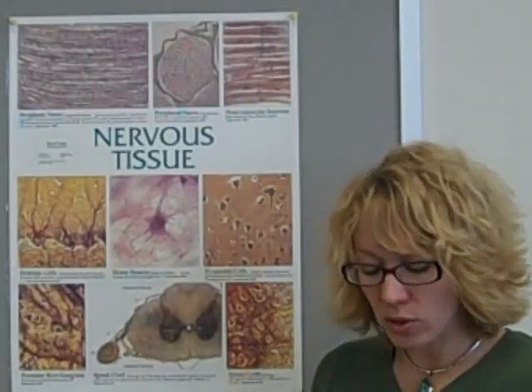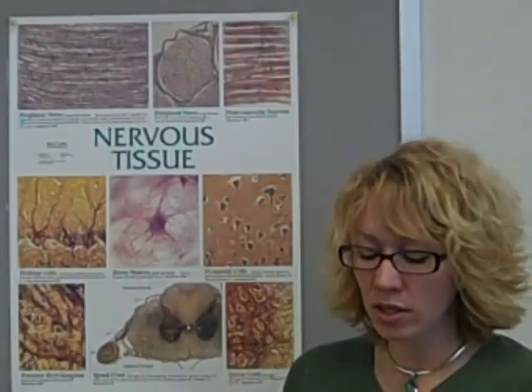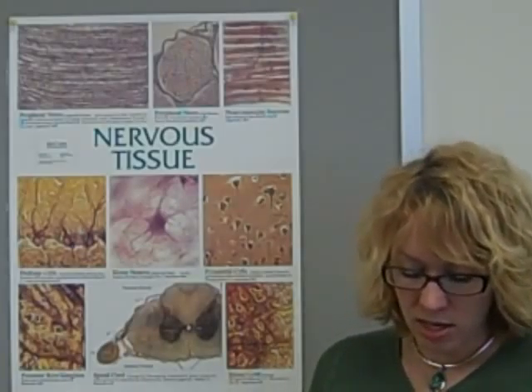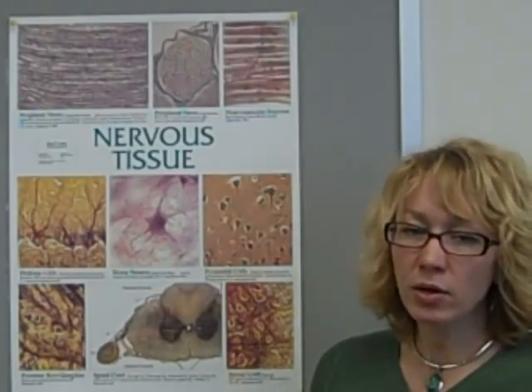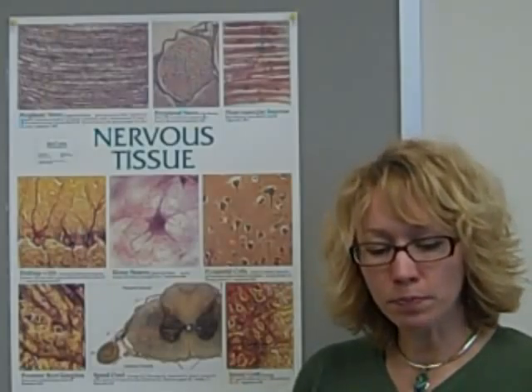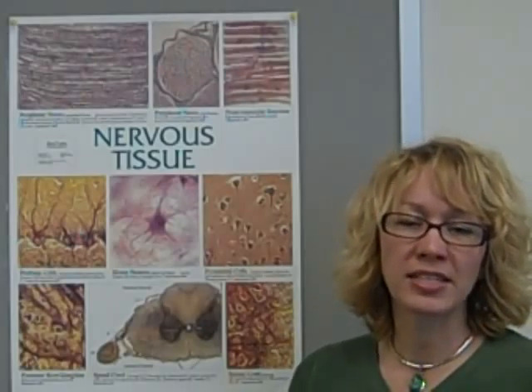Your lab manual doesn't really go into a whole lot of examples of neuroglia. They just say that there are several types. Your textbook goes into a little more detail with astrocytes and some others. I'm not going to ask you to memorize those. I want you to know neurons, the basic parts of a neuron, and that neuroglial cells would surround and protect the neurons. And so again, to summarize, we've talked about 4 tissue types: epithelial, connective, muscle, and nervous. And the idea would be that you could look at an image and recognize it. So for the lab quiz that I'll be posting later, you'll see images and you'll be able to label what they are. So think about things like cell shape, cell arrangement, and hopefully you'll be able to recognize these various tissue types.